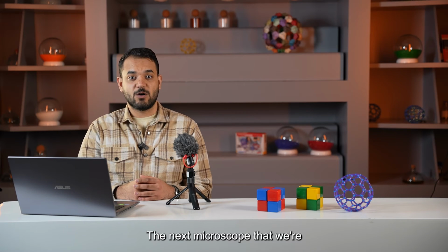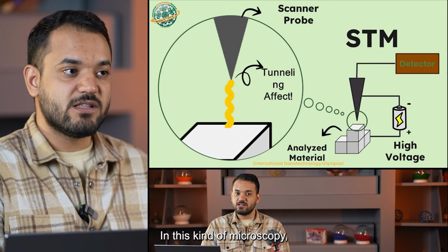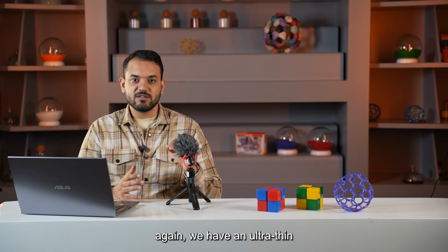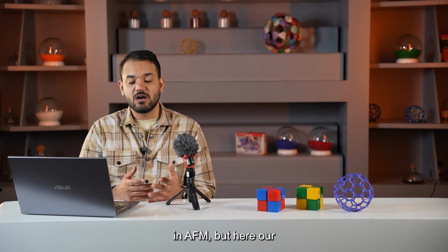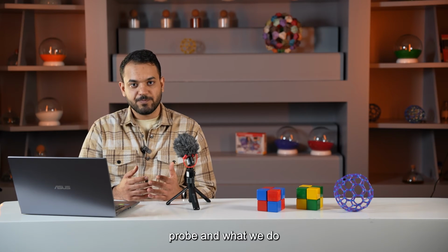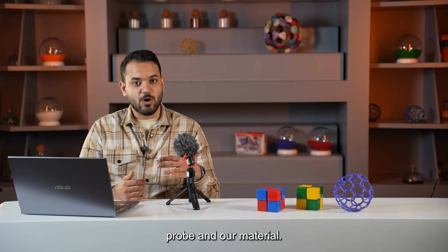The next microscope that we're going to study is STM. STM stands for Scanning Tunneling Microscopy. In this kind of microscopy, again, we have an ultra-thin probe, the same as we had in AFM. But here, our probe is actually a conductive probe. And what we do here is that we apply an electrical field between the probe and our material.